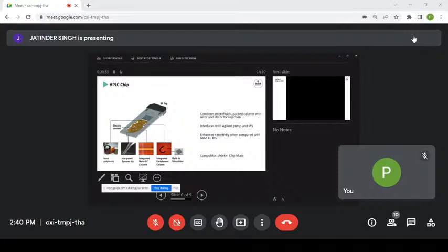So the nice part in here is that it combines a microfluidic packed column with a rotor and a stator, so things that turn around. And I'm assuming that today with the tour, you've seen how things are injected into the HPLC. You turn the valve around and you redirect the flow paths. Same thing happens here. It interfaces with Agilent pumps and mass specs. The movie we'll be watching is a couple of years old, but all new generations are compatible as well. And it's got enhanced sensitivity compared to nano LCMS.